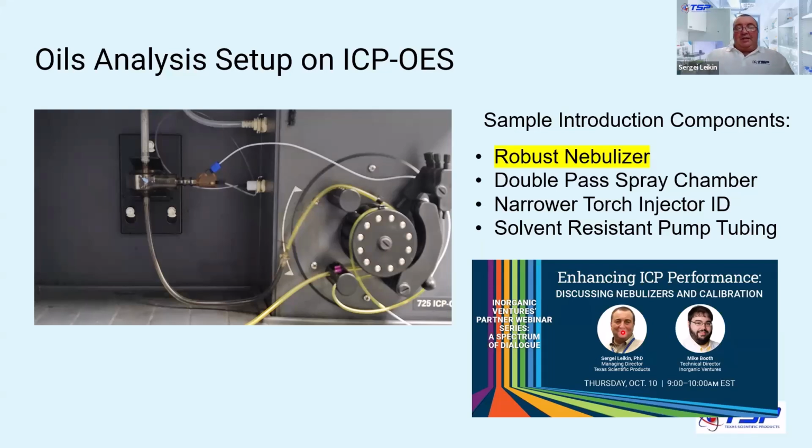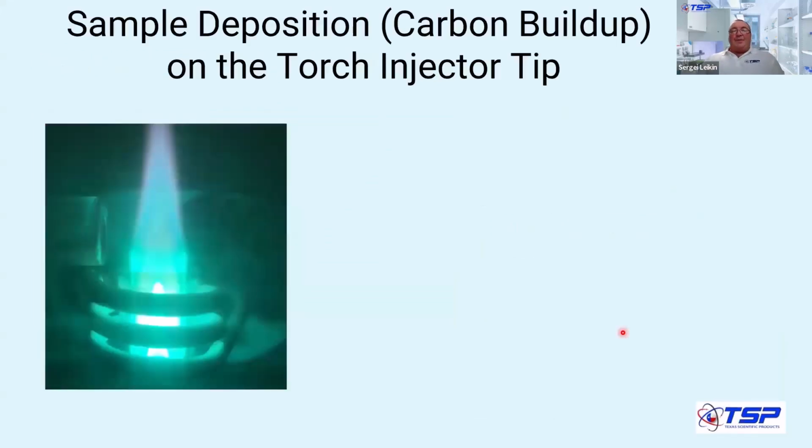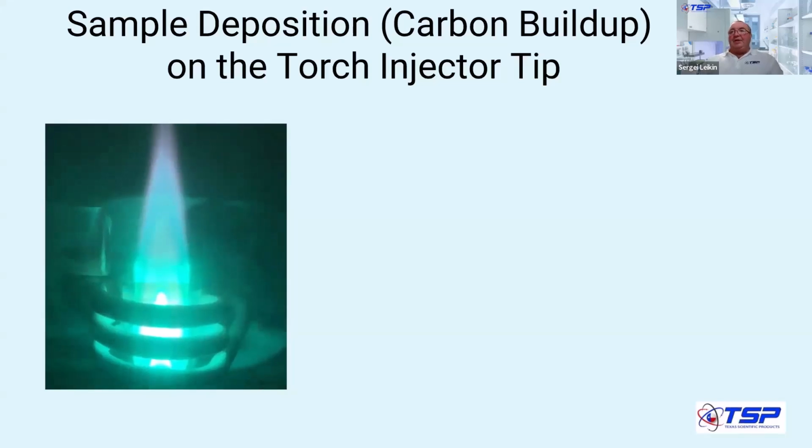So when you get this set up and then you start to run organics, what happens next? You will see here the plasma is alive and everything looks good.